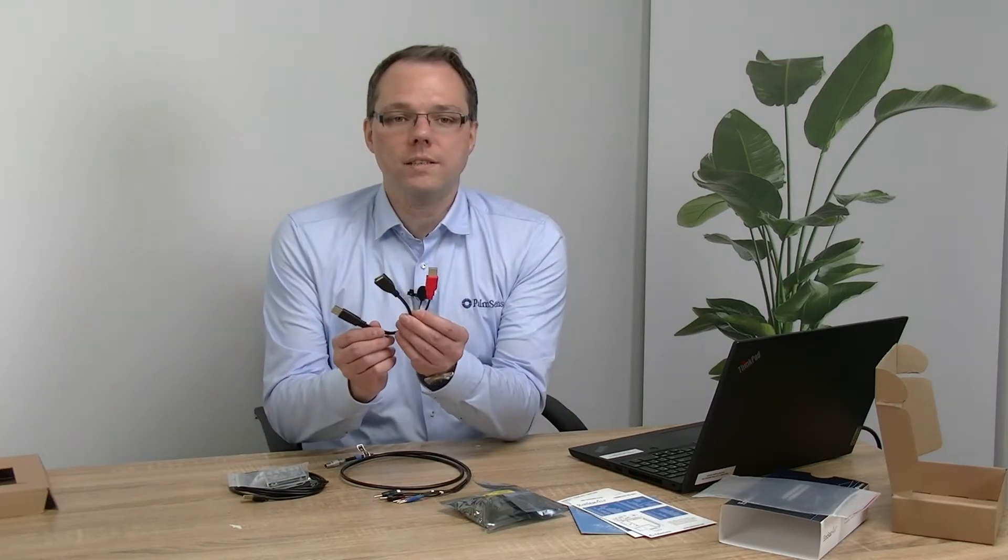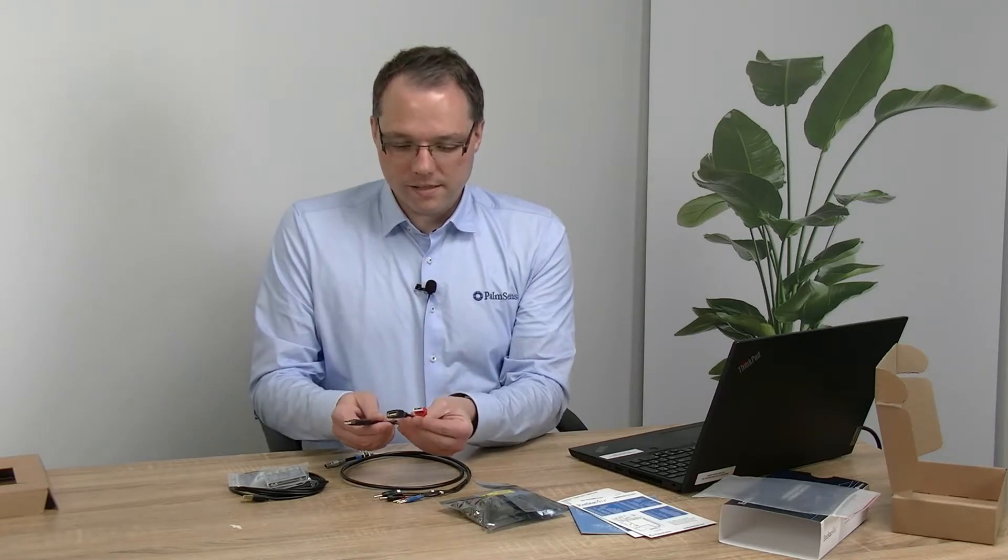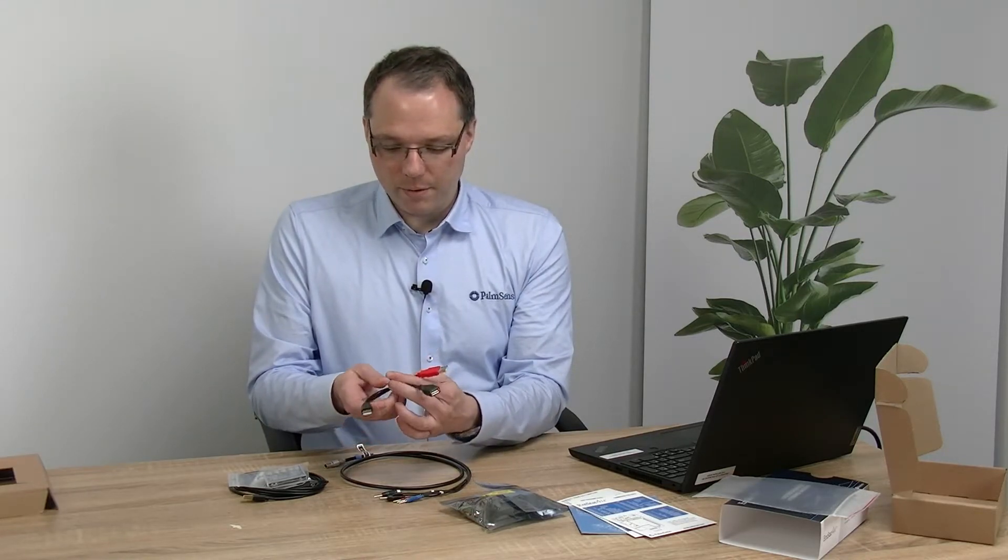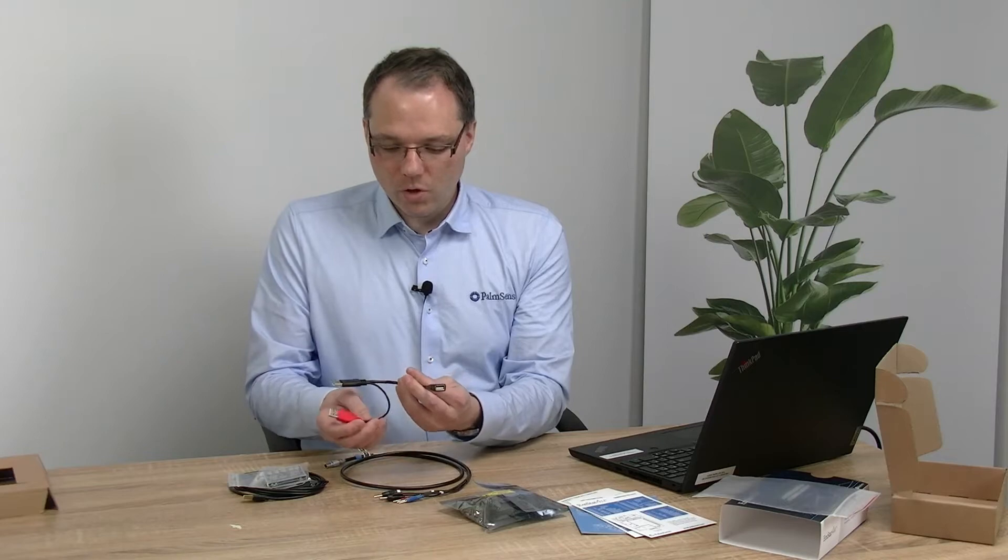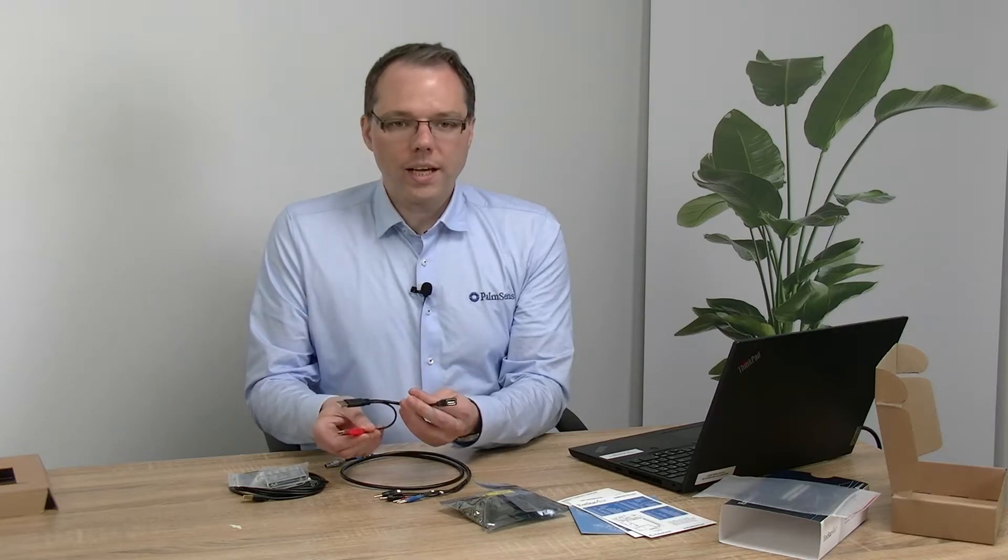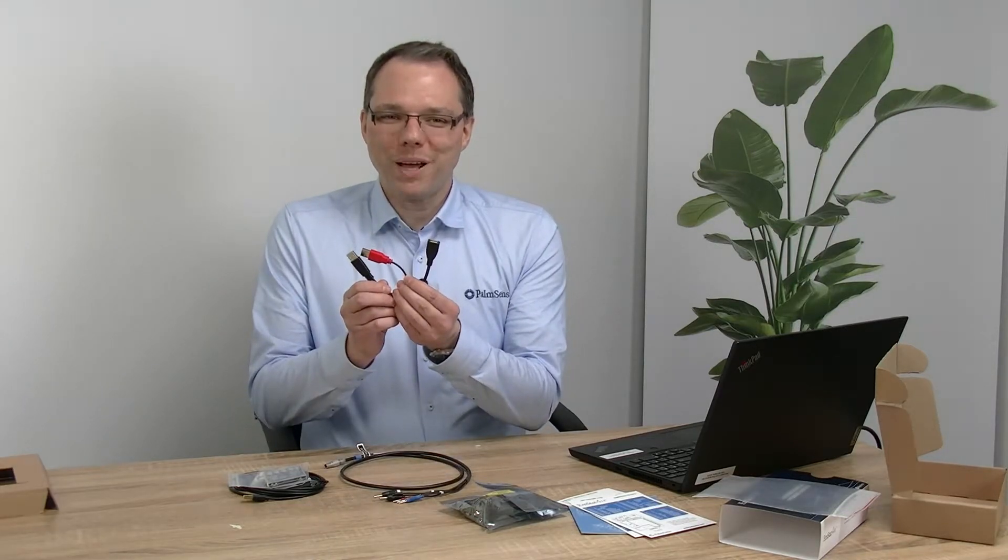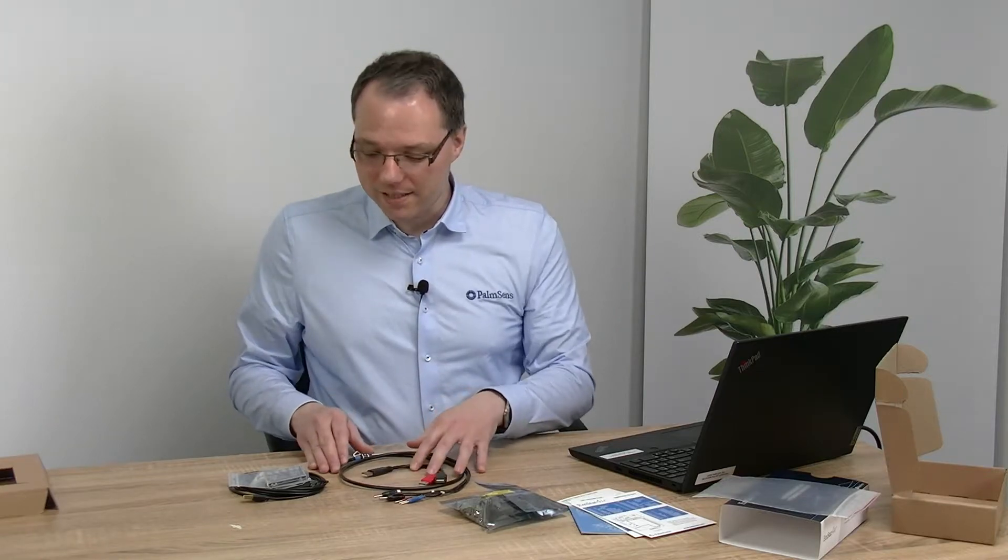If you have the low range version your cable won't have the sense lead. Another difference when you have the high range version is you get this splitter USB cable. This enables you to connect your potentiostat module to two USB ports because when it draws a lot of current, a single USB port just does not provide enough power, so you're prepared for that with the development kit.